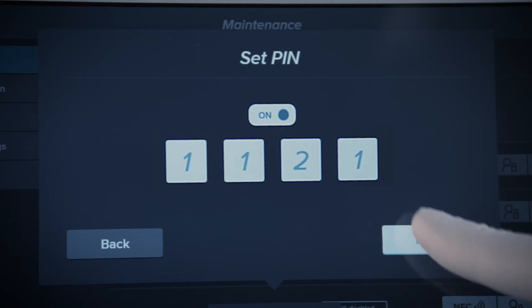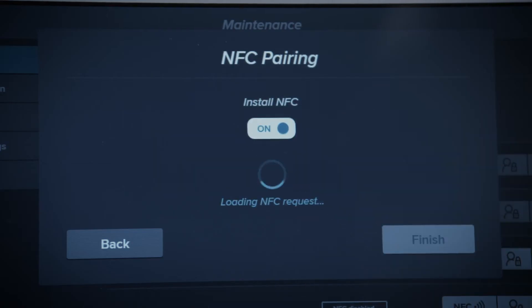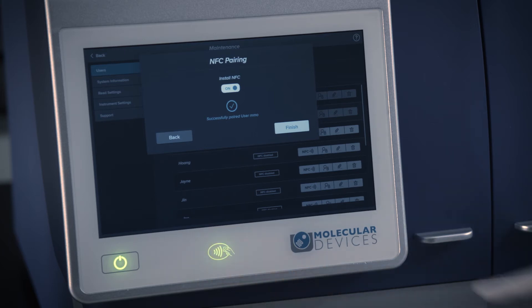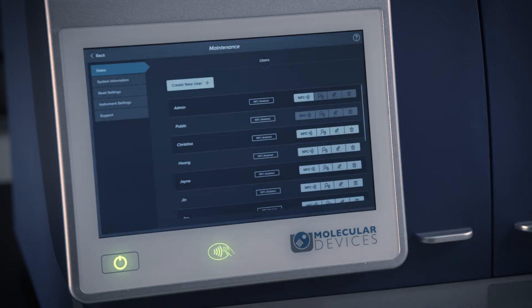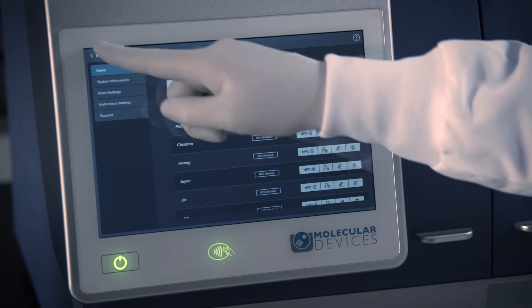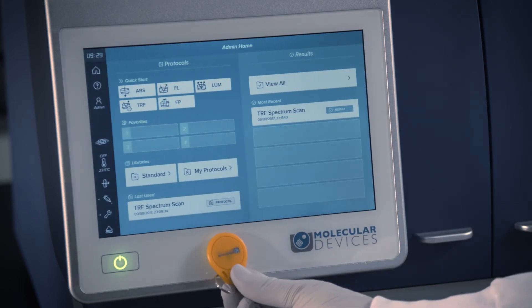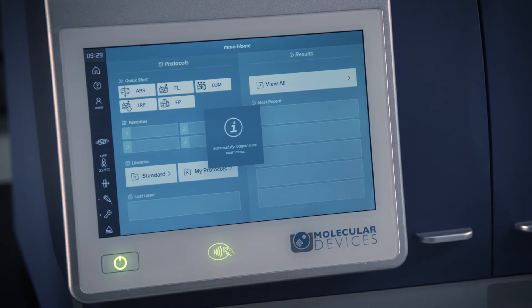If you wish to program an NFC tag for personalization, hold the user's tag next to the NFC symbol below the touch screen to turn on the NFC pairing function. After your NFC tag has been successfully paired, it will personalize the homepage with your protocols and your results every time you tap your NFC tag on the detector.